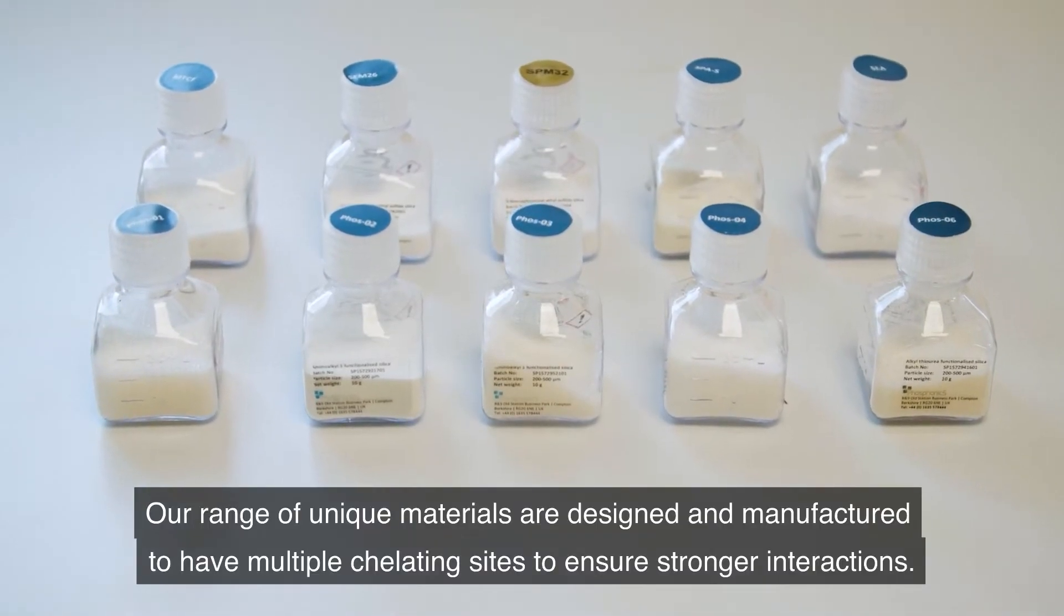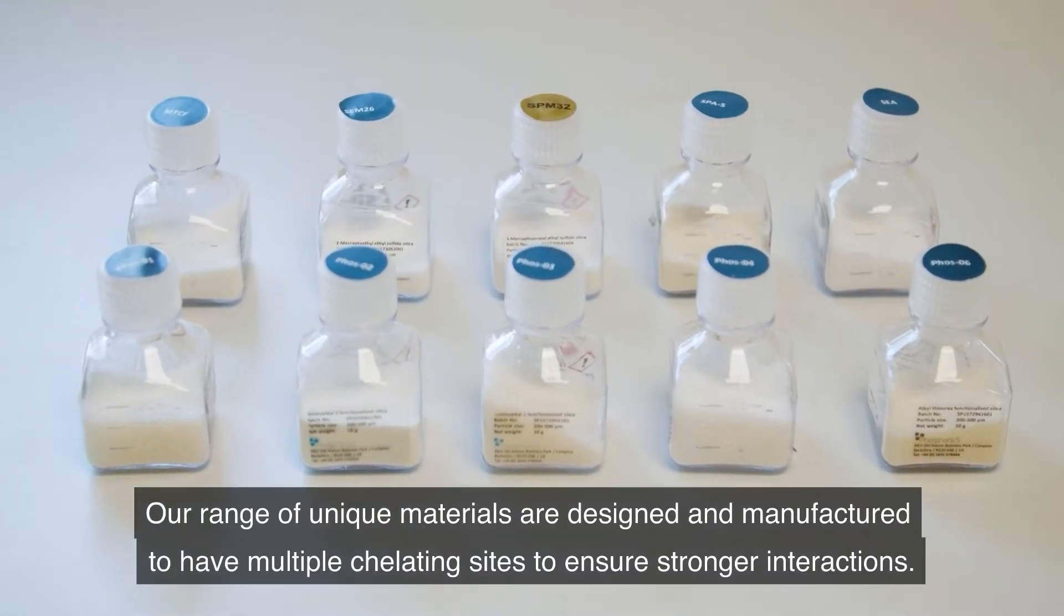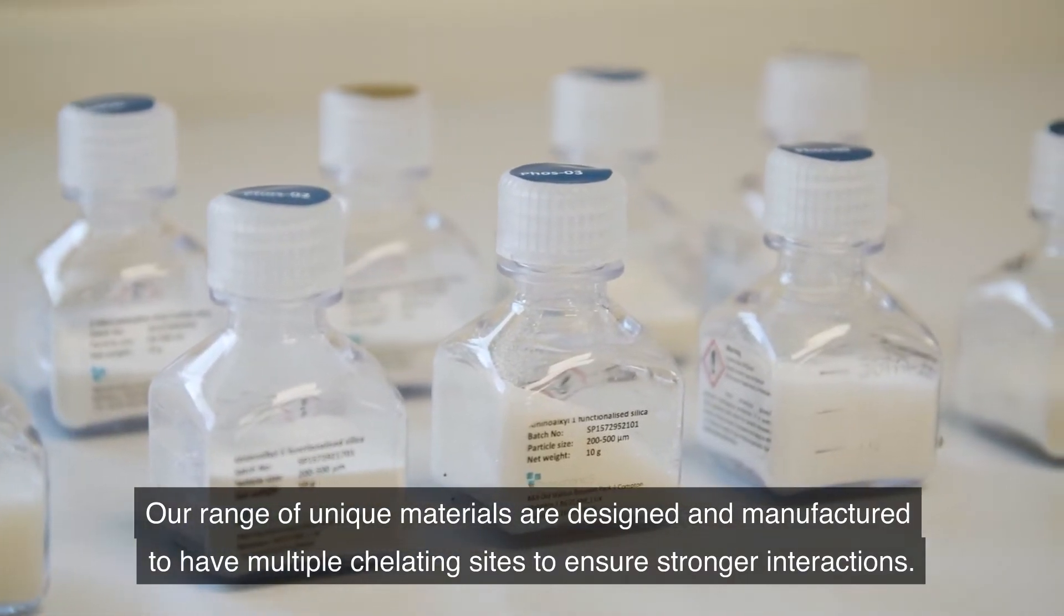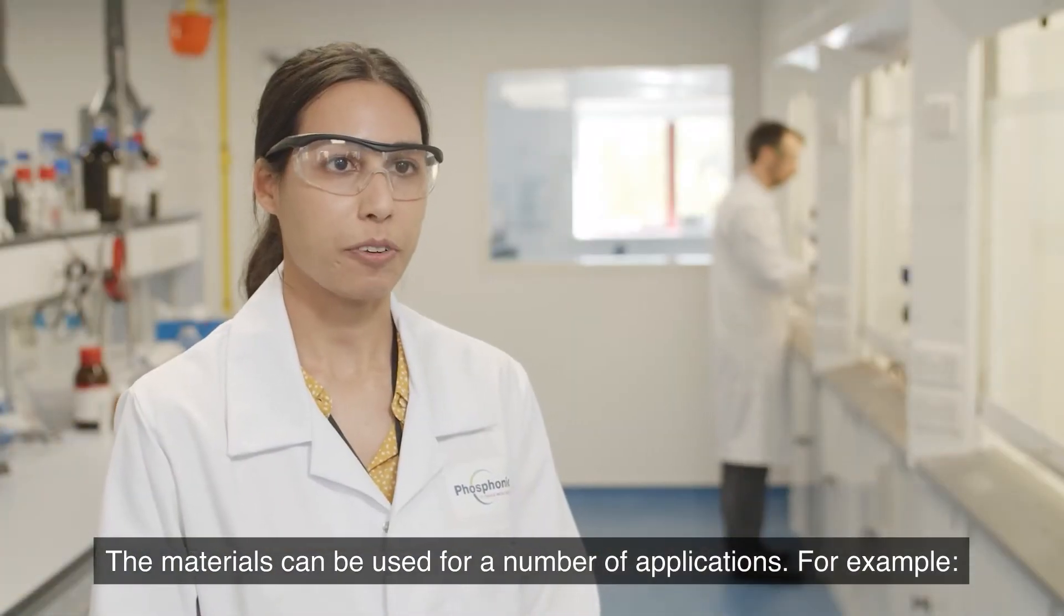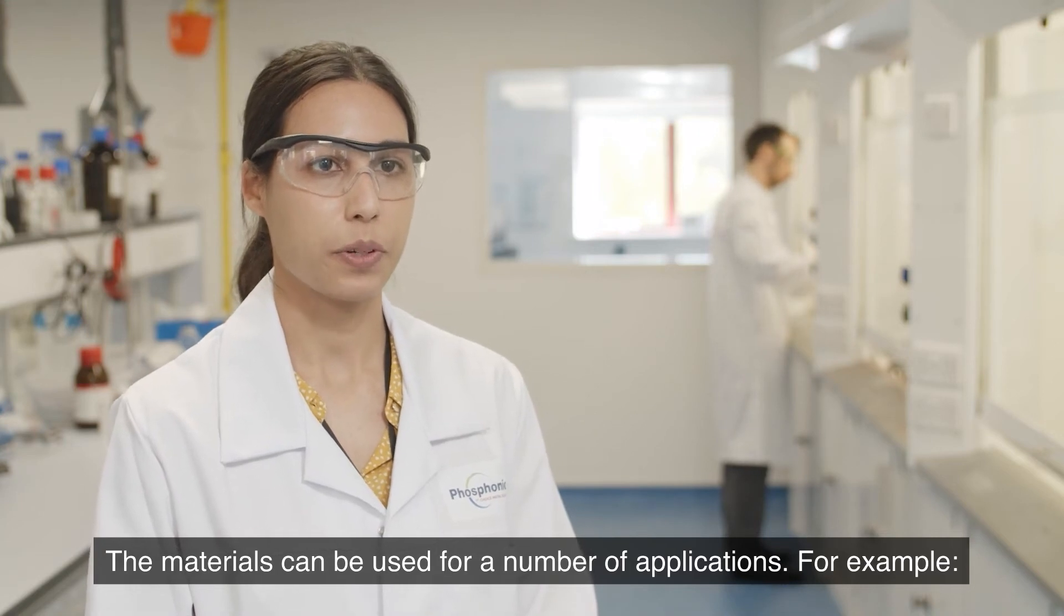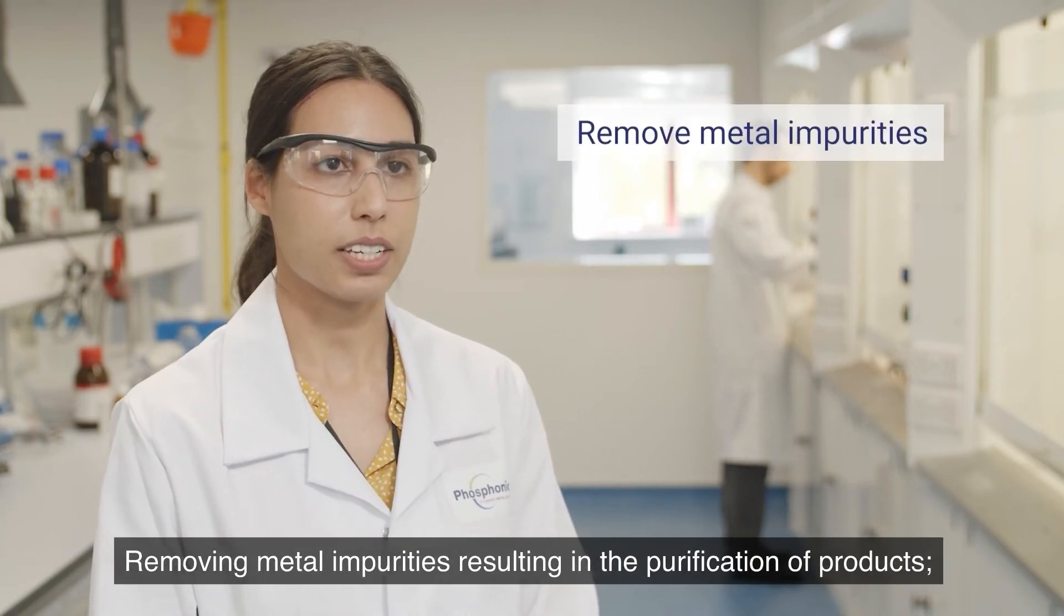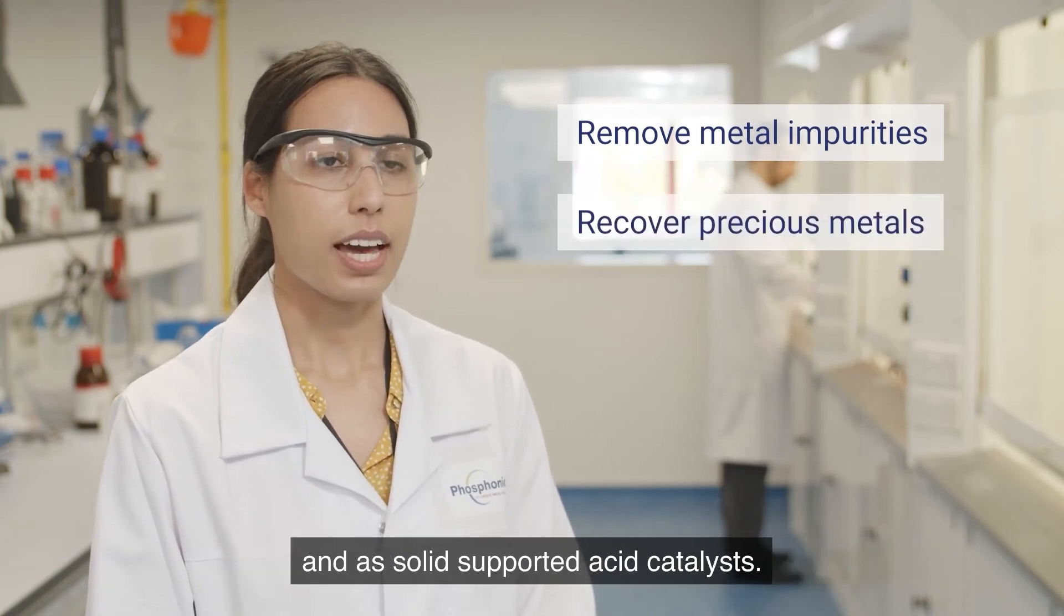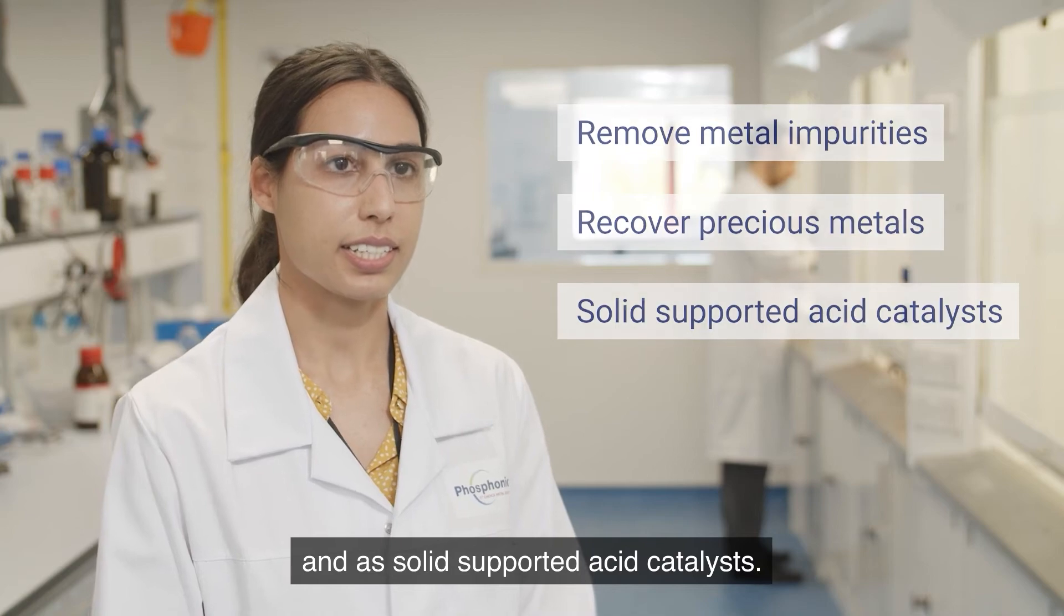Our range of unique materials are designed and manufactured to have multiple chelating sites to ensure stronger interactions. The materials can be used for a number of applications, for example removing metal impurities resulting in the purification of products, to recover precious metals from waste streams and our solid supported acid catalysts.